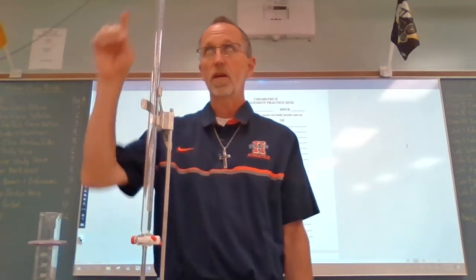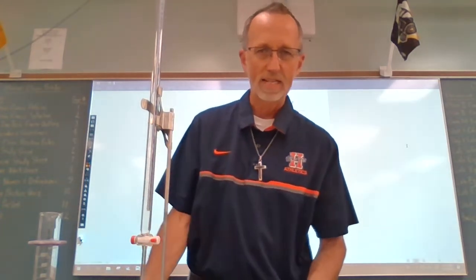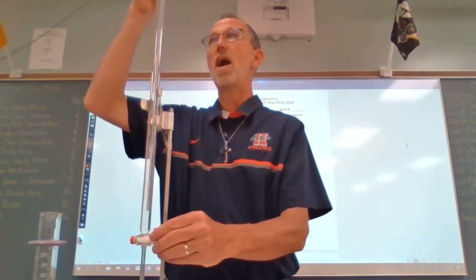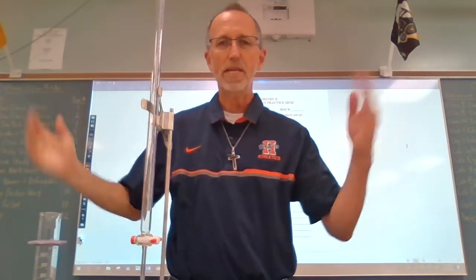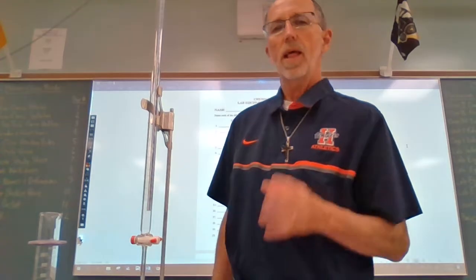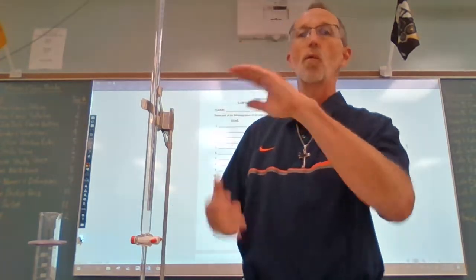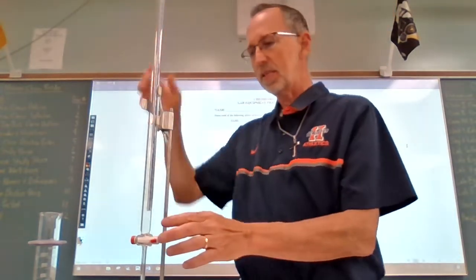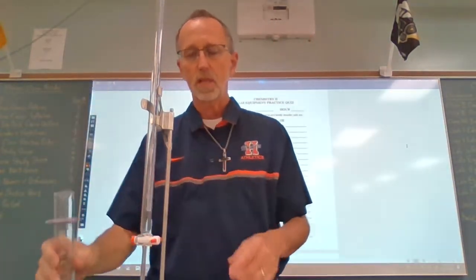But you fill this up, and you want to release 10 mLs. So we have another beaker or Erlenmeyer flask down here, and we look up here and we release it, and it goes down, down, down, and when you get to 10, boom, shut it off. Easy peasy. So the volume measurement numbers on a burette are reversed. 0 is at the top, and this is a 50 ml, I believe. Oh, no, this is 100 ml, so these hold the same volume.